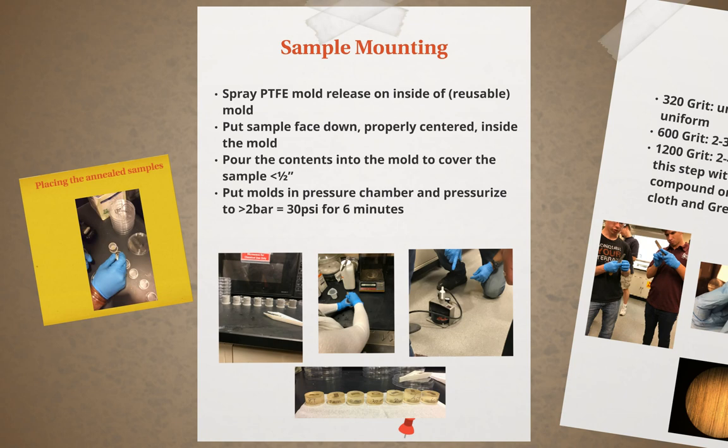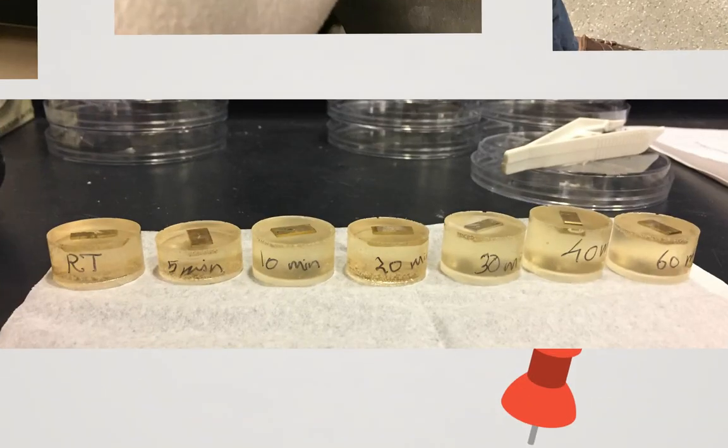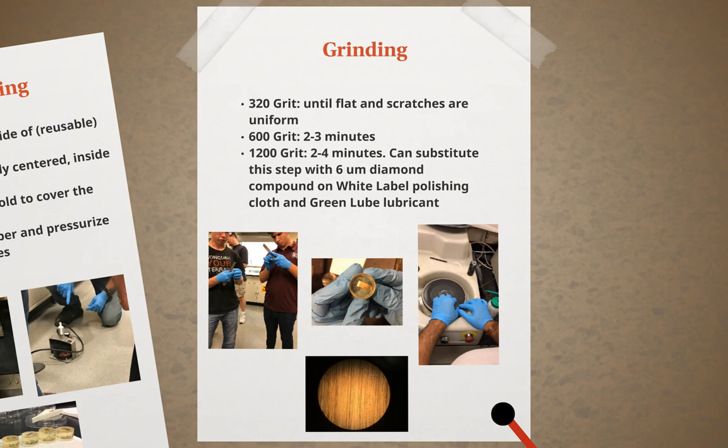It's important to keep each sample labeled correctly. After the mold has set, we can begin the process of grinding and polishing the sample. The epoxy mounted sample will undergo a series of grinding and polishing with progressively finer grit. To begin, the 320 grit is used and the sample is polished until it is flat and the scratches are uniform in size and direction. Then the 600 grit will be used for about 2 to 3 minutes, and the 1200 grit for 2 to 4 minutes after that. The 1200 grit can be substituted with a 6 micrometer diamond grit if needed.